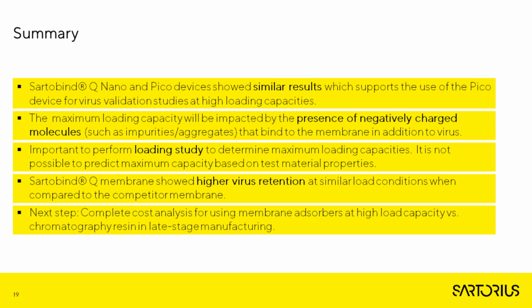It's important to perform a loading study to determine the maximum loading capacity. Unfortunately, it's not possible to predict the maximum capacity based on the test material properties. As we saw in the study, we couldn't really pinpoint which attributes caused the breakthroughs.